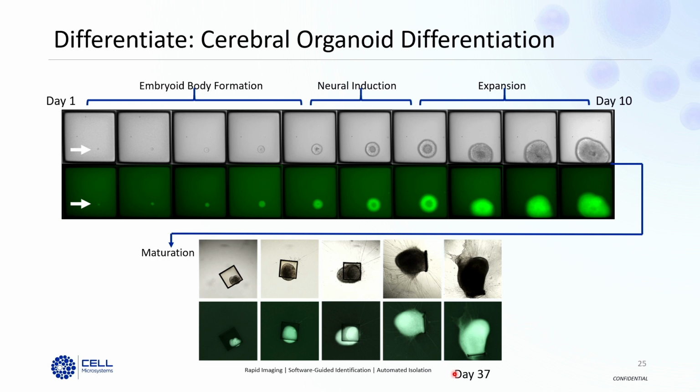Definitely. For suspension cells and adherent cells, we recommend imaging every 24 hours or every doubling stage. You'll start to see if they do start coming off, and you can always isolate earlier if needed. But that whole process of growing them on the raft is typically only 3 to 5 days before you get a sizable colony that you can isolate. By that stage, they're still stuck down to the raft very well.